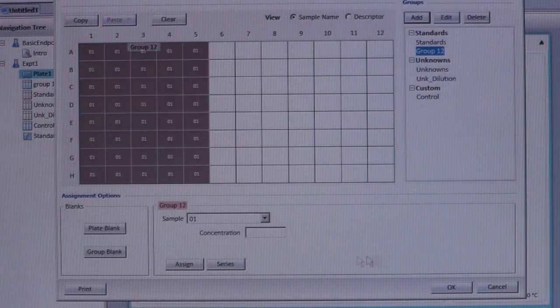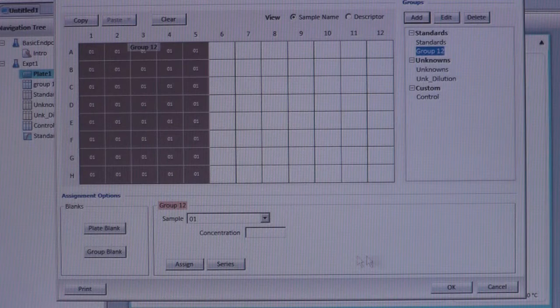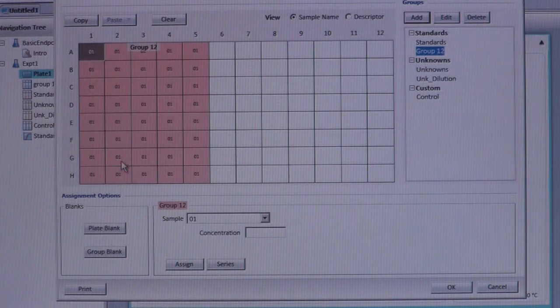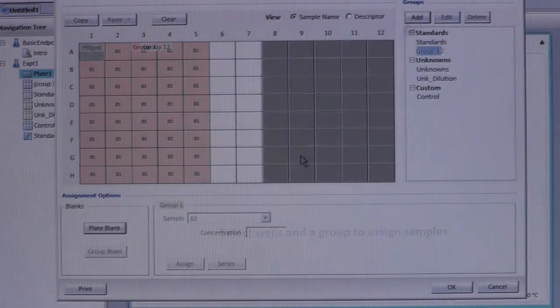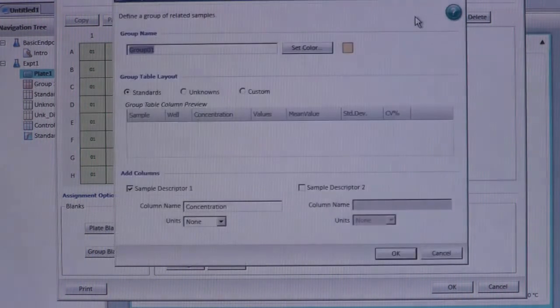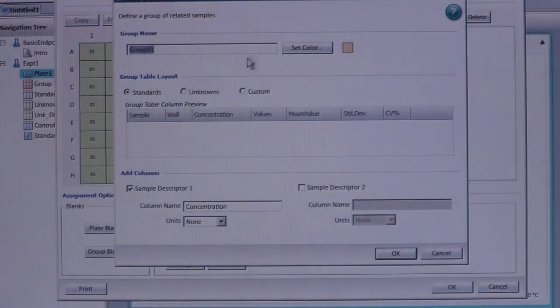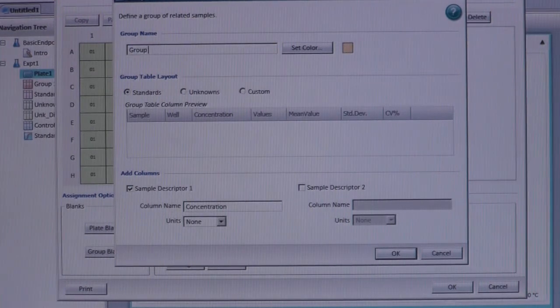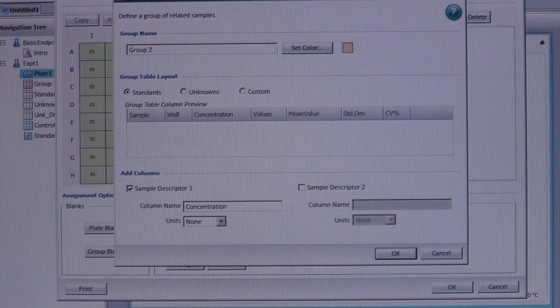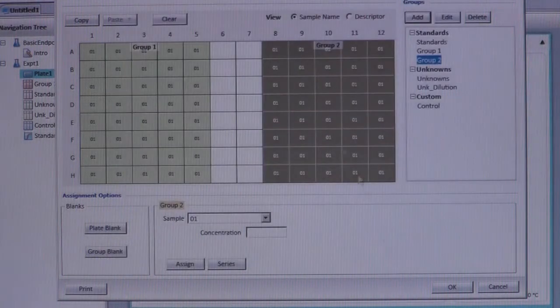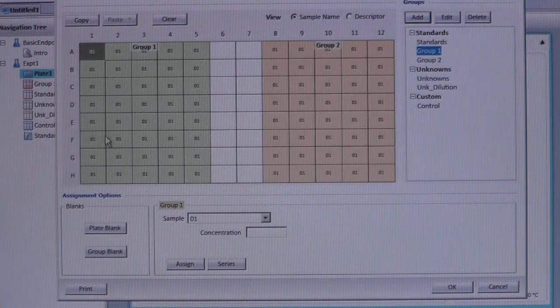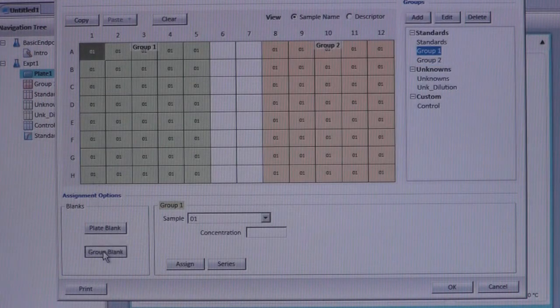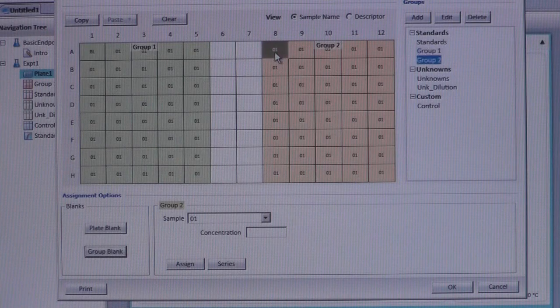Next, select Plate Blank or Group Blank. If you're doing a single analysis, you will likely only need one blank for the whole plate. In that case, select the well and click on Plate Blank. However, if you're performing more than one type of test on a single plate, you will need to create groups that each have their own blank. To create a group blank, simply select the designated well for that group and click on the Group Blank option.